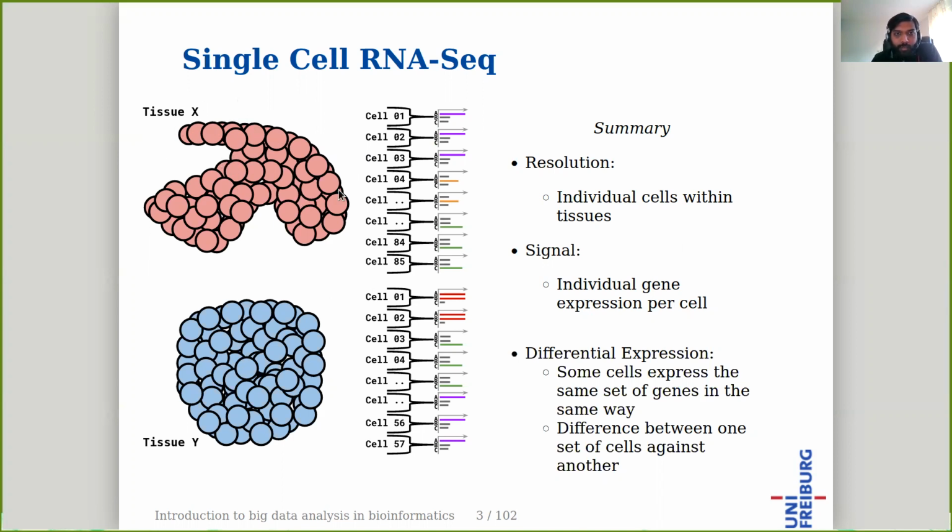expression profiles compared to this set of cells here. So this is the whole point of differential expression in single cell. It's not just comparing between tissues, it can also be within one single tissue. You are looking at how the expression profiles of individual cells are.